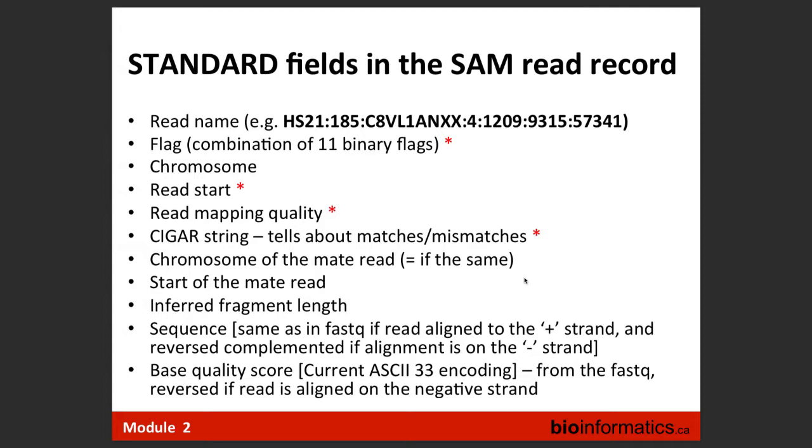And there is a very nice website from Broad. I have the URL on one of the next slides, where you can just check a box for which value of which property of the read you would like, and it gives you the numerical value of a flag, which can be very useful for you. It didn't exist in the early days, so you had to calculate on a piece of paper, the back of an envelope. Chromosome, read start, and I will talk about this.